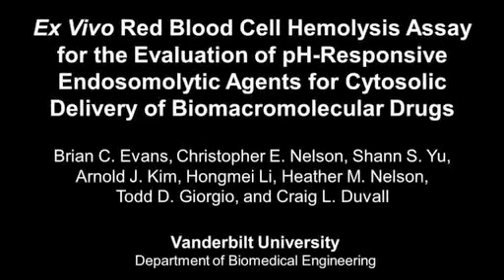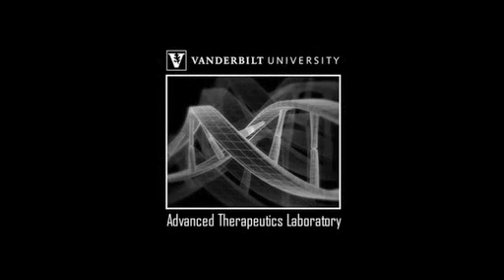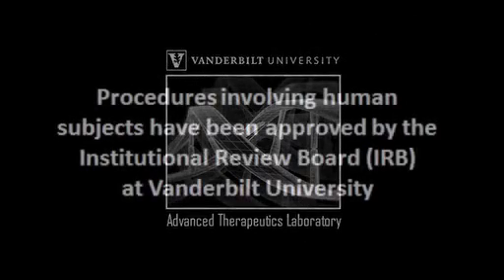The overall goal of this experiment is to quantitatively assess the membrane-disrupting potential of drug delivery vectors for the intracellular delivery of biologics, with red blood cells serving as a biological model of the endosomal membrane. This video was produced by the Advanced Therapeutics Laboratory at Vanderbilt University.